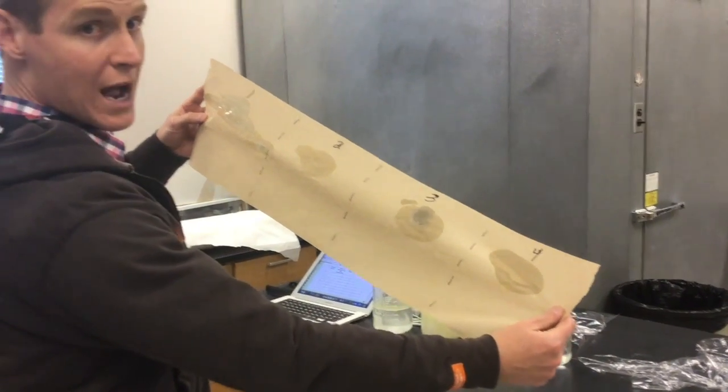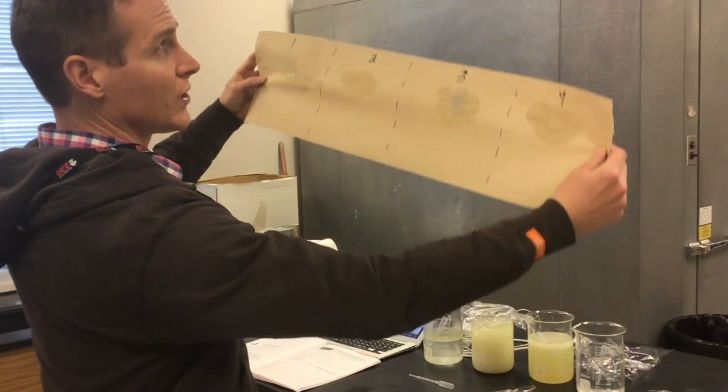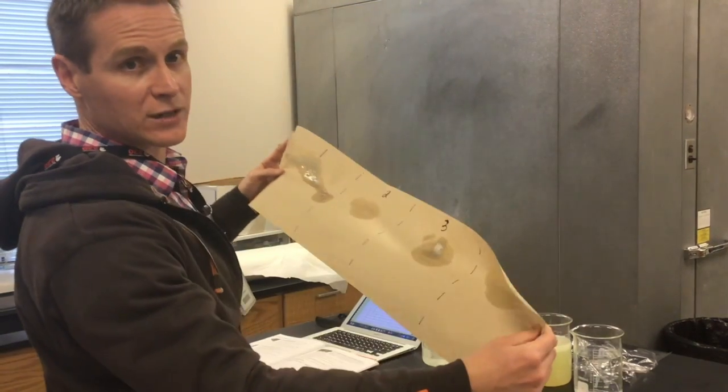Once it's all dry, if the unknown had a lipid in it, when we hold it up to the light, it should be transparent.